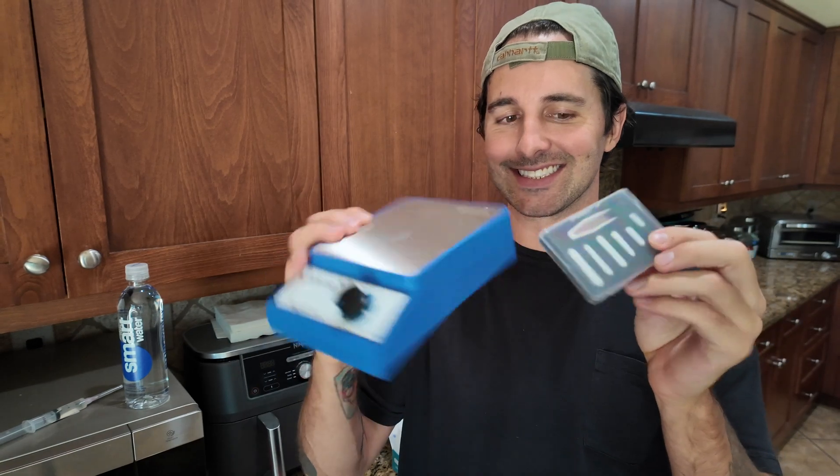Also, while it's not necessary, I really recommend getting a magnetic stirrer, and I'll explain why in a couple of minutes.